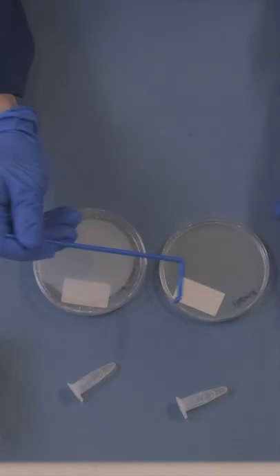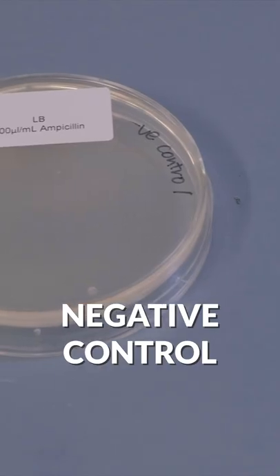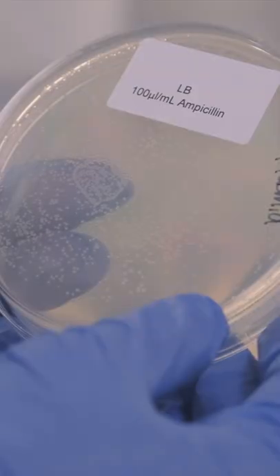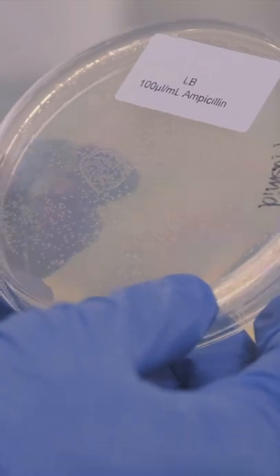Only bacteria expressing the new gene will be able to survive on these plates, so a negative control shouldn't have any bacterial cells surviving. In fact, if there are colonies on your negative control plate, you actually can't trust all the colonies on your actual experimental plate.